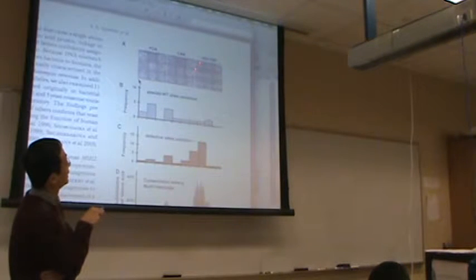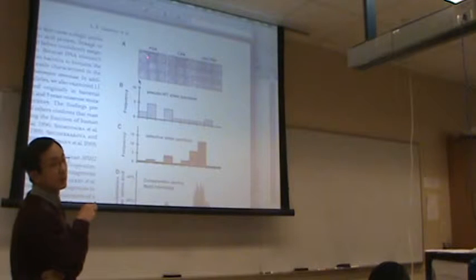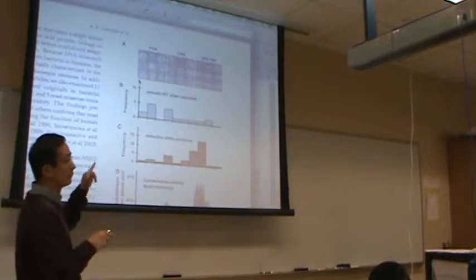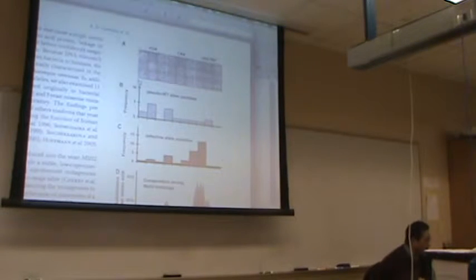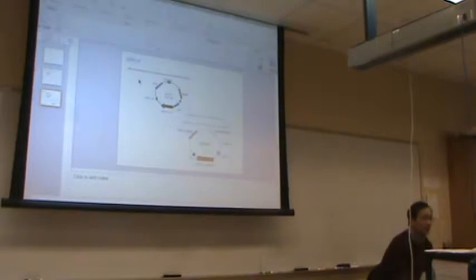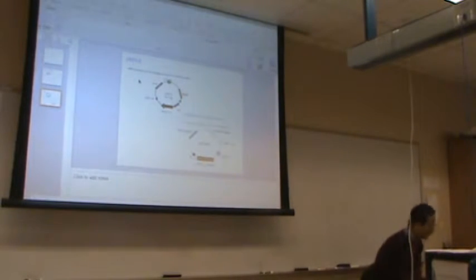This is the complete deletion of MSH2. This one has a lot of growth. So this is something called a negative selection. Why is this the case? Because it goes back to our plasmids.